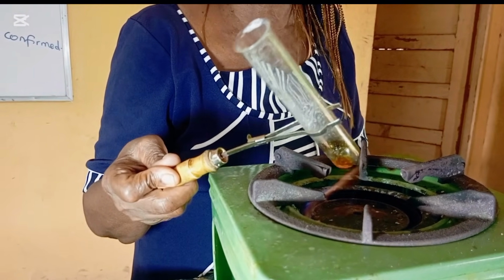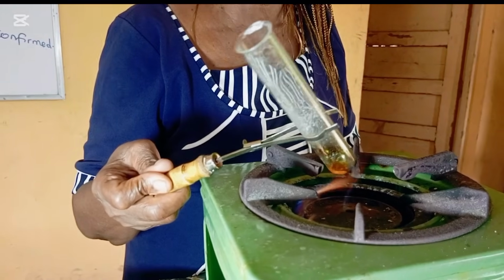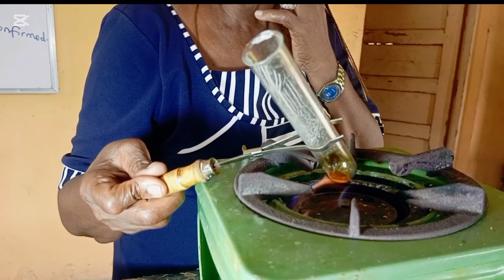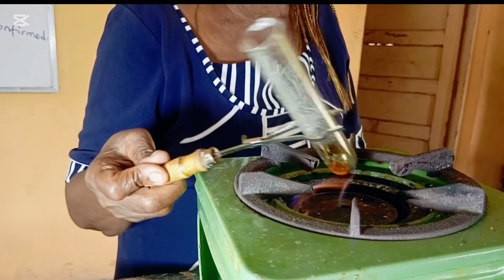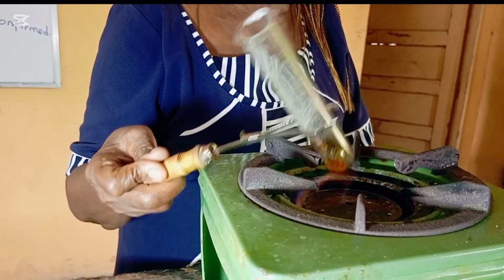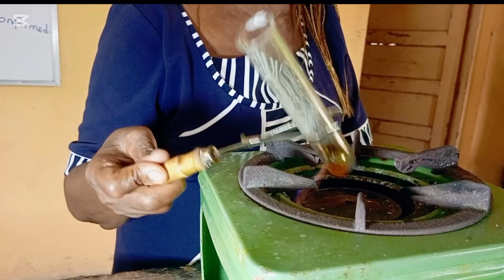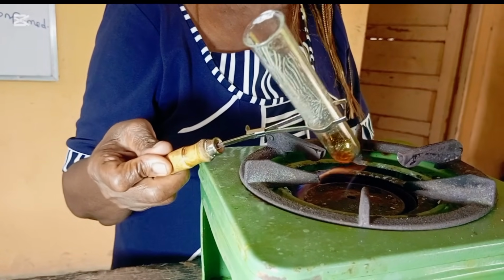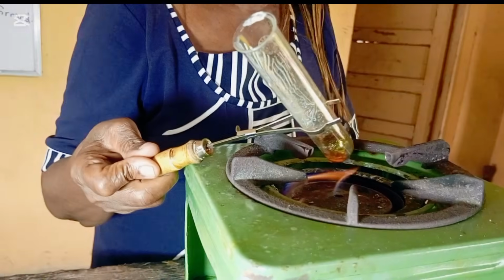Just like I earlier said, I don't have the correct litmus paper. It will change that blue litmus paper to red, meaning that the gas is acidic. And if it is confirmed with starch iodide paper, it will turn it blue-black.